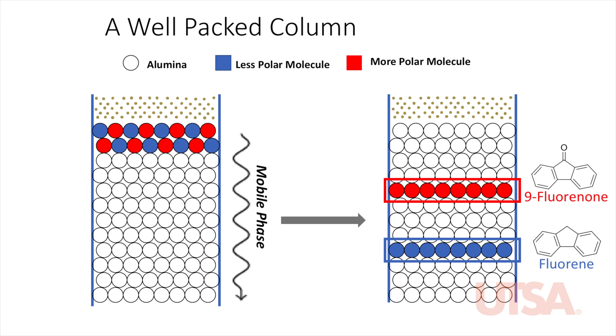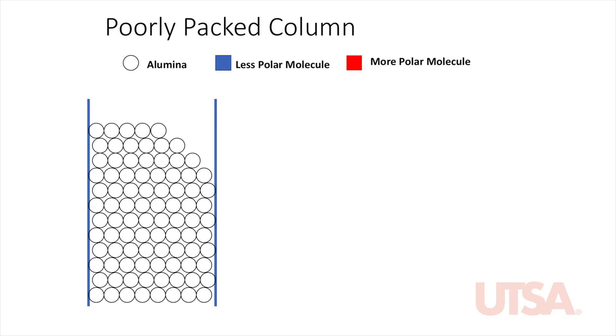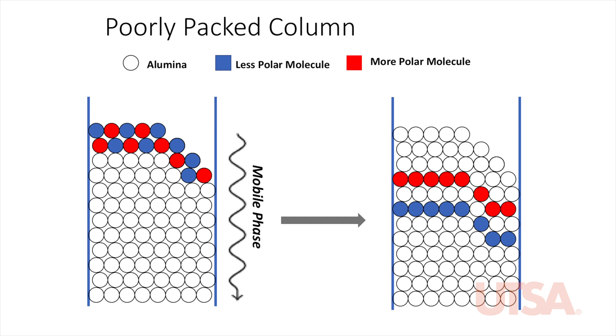As the mobile phase travels through the column, the molecule with a greater affinity for the mobile phase will elute first. Without the addition of sand, the alumina can shift as the column is adjusted and the solvent is poured. This will lead to an uneven starting point for the molecules, and the procedure will be compromised. Do your best to make sure the alumina stays level. Shifted alumina will skew your results.